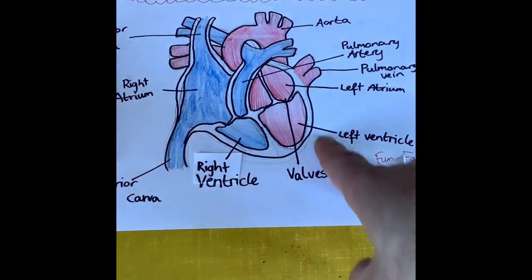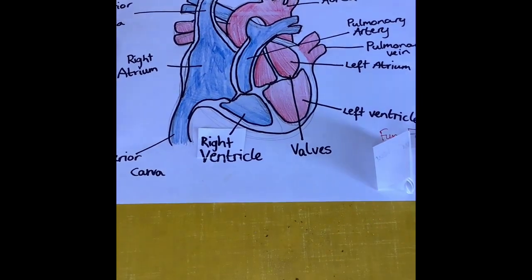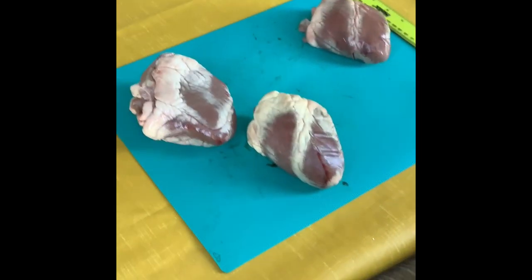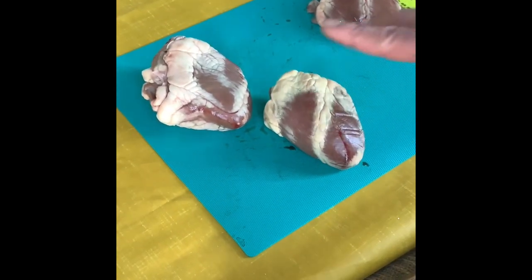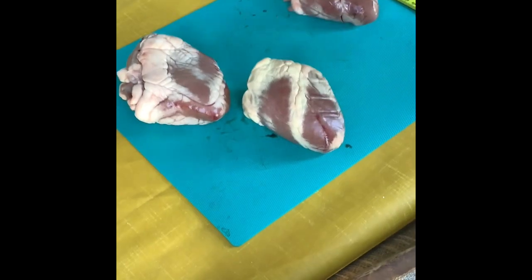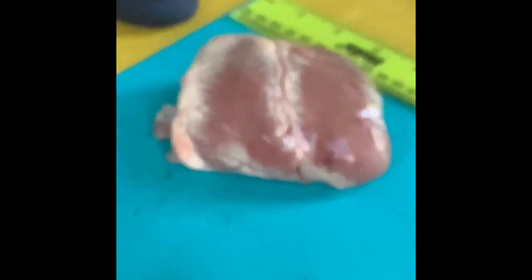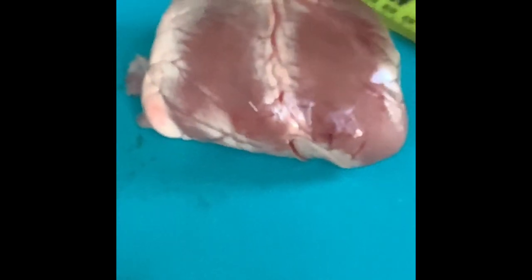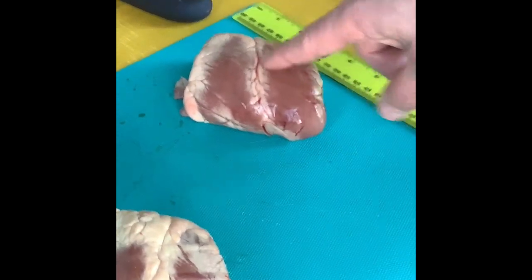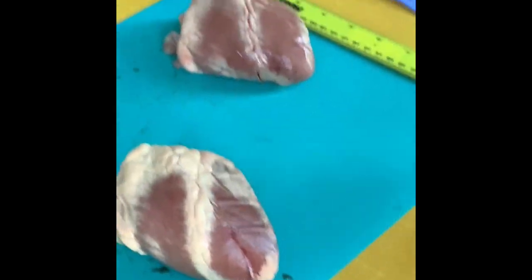The left-hand side of the heart is a lot thicker, which we're going to look at now using some lamb hearts. These are similar in size to human hearts, maybe a little bit smaller. You can see there's quite a bit of fat on them. This here is the coronary artery — the artery that actually feeds the heart muscle itself. This is what gets blocked in a heart attack. It's nothing inside the heart; it's this vessel on the outside.